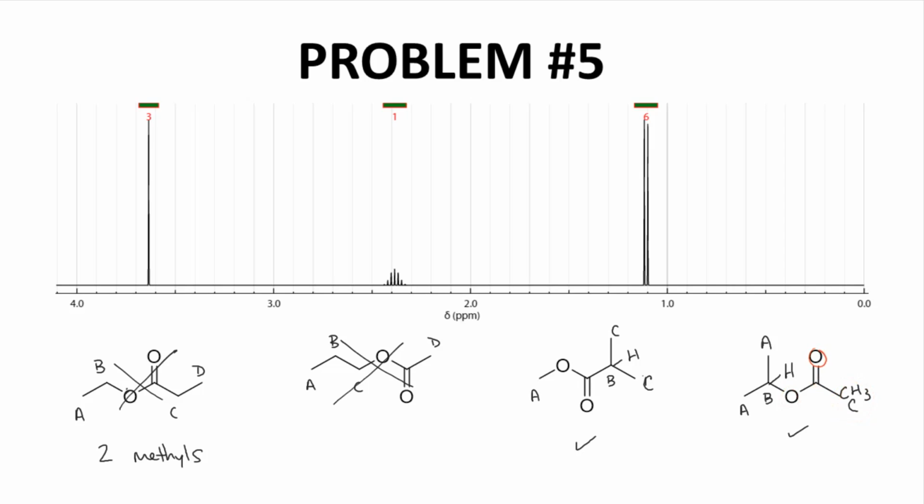They really don't have a big impact. It's what is the atom that's directly next door. For this CH3, it's just a carbon. For this CH3, it's an oxygen. The chemical shift of this signal is a much better match for our third structure, answer C.